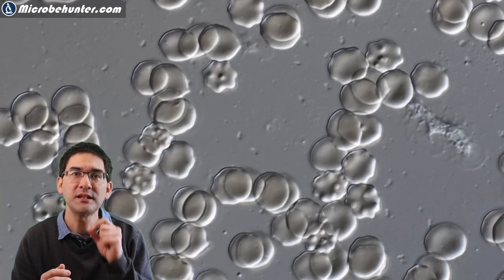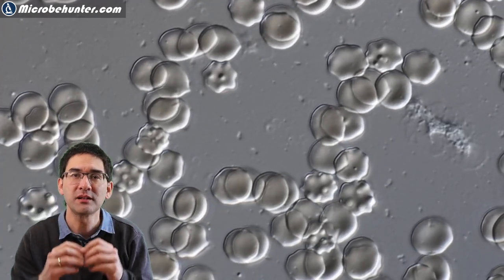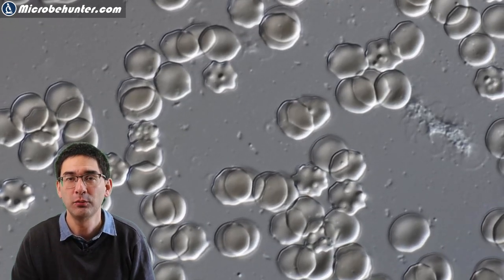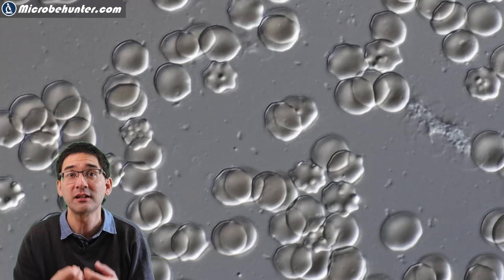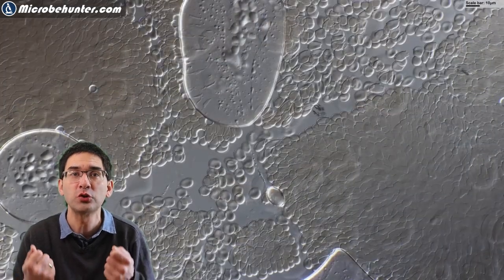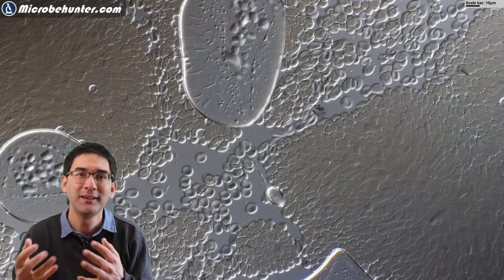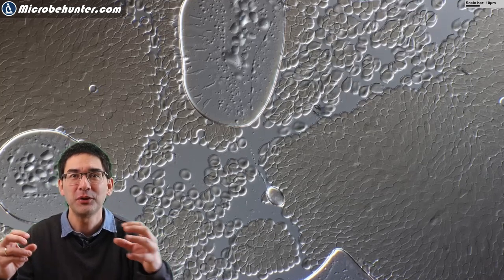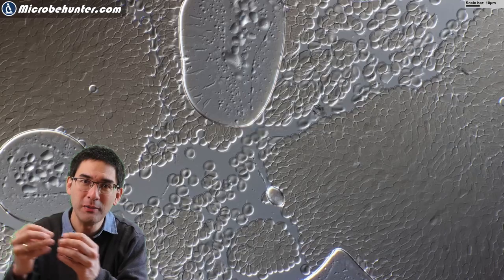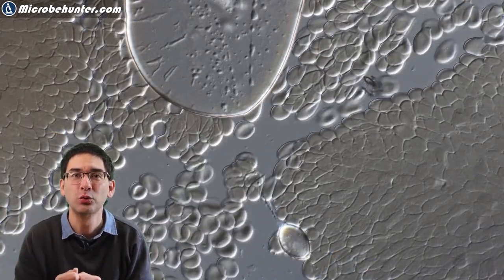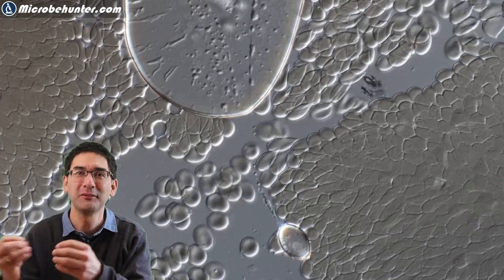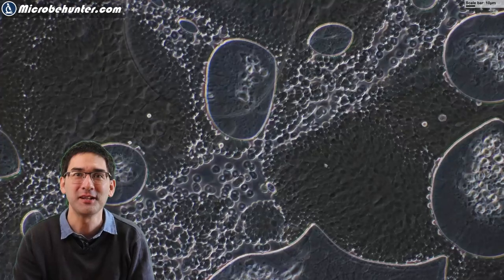After a few minutes, I could see that some of the red blood cells started to become a little bit irregular. These are called echinocytes. These are essentially red blood cells that start to deform because they start to lose water. This is a very nice picture here where you can see some of the red blood cells streaming across the slide. And on the side, this is where the blood already started to coagulate and stick to the glass slide. It almost looks a little bit like blood passing through a blood vessel.